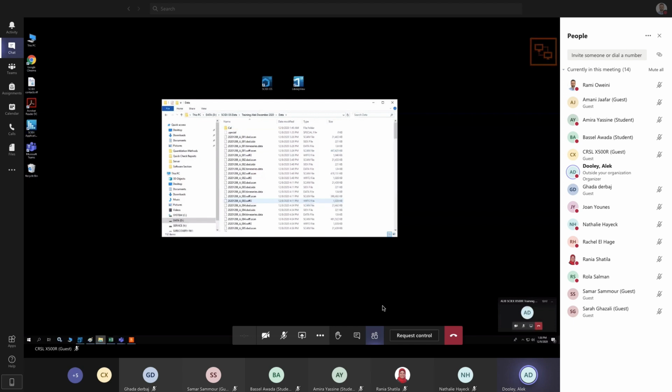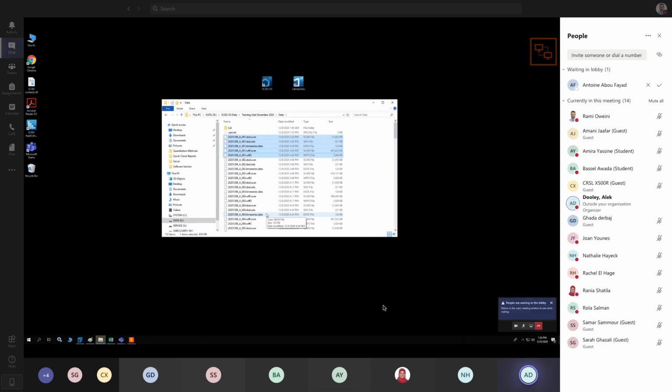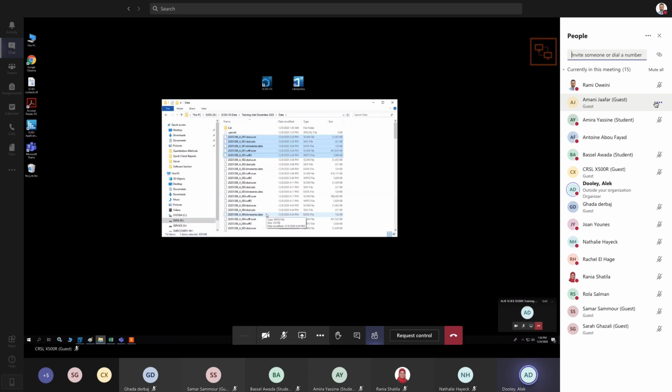Collected yesterday, and you can see that the data is actually, okay, you have a DAD, so there are 5 files. So all of those 5 files are what you would need to transfer. I'm not sure if you need to transfer the DAD. To be honest, we didn't use that. I'm not sure that actually you'll get something useful from the DAD and also see it in the mass spectrometer.